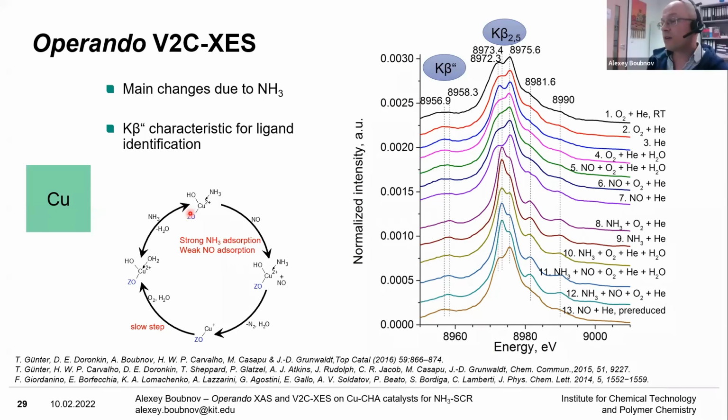Okay, to form a nitride, I cannot really say if it's being formed, and it's reversible, it can be removed as easily when you remove the ammonia flow. Of course, it cannot be excluded, but this is not a model which we have considered.